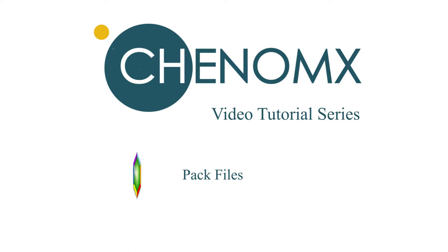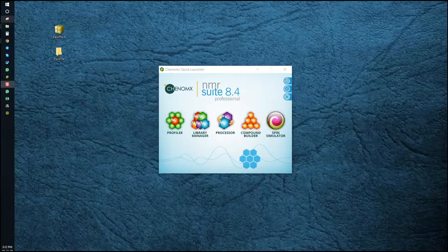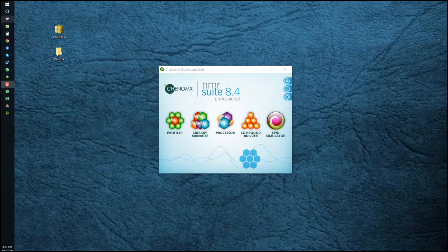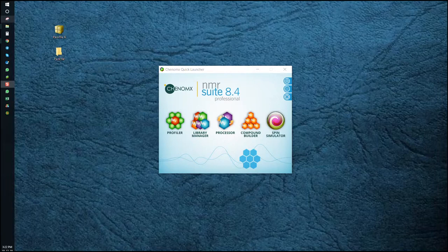Welcome to the Konomics video tutorial series. In this video I'm going to show you how to make a PAC file. PAC files allow you to create new libraries as well as transfer lists of compound signatures between software terminals.